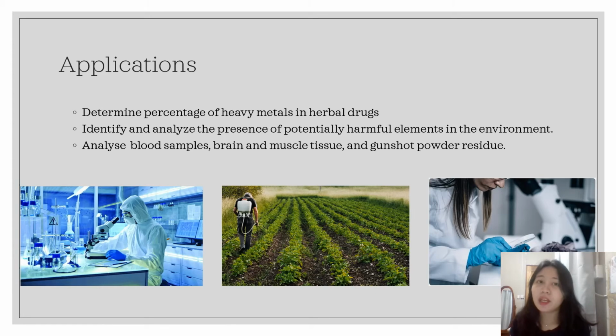There are many applications for AAS, atomic absorption spectroscopy, but I'm going to list only three. This is a picture of pharmaceutical, this is agriculture, and this is forensic.